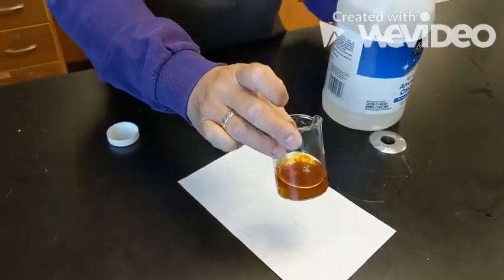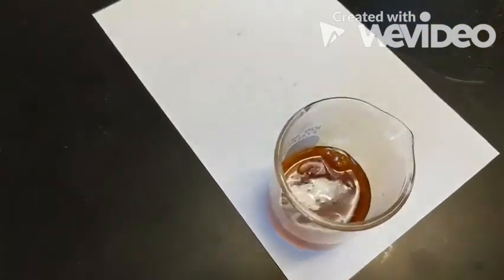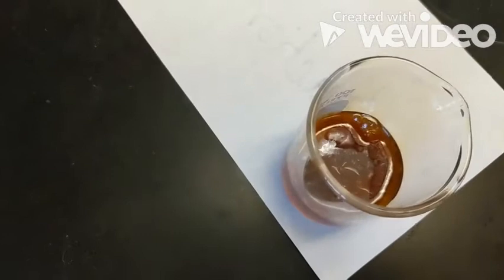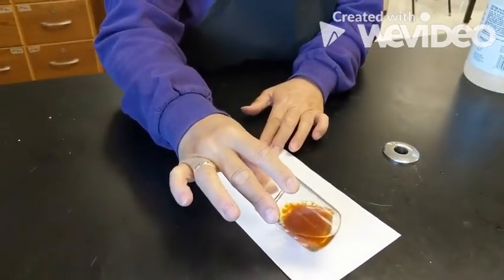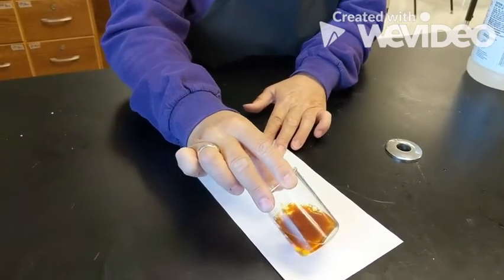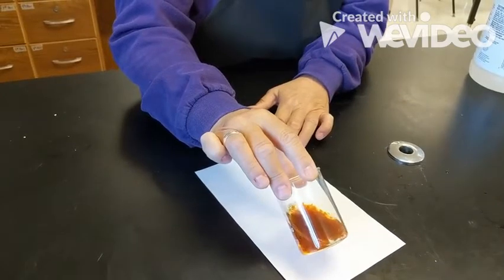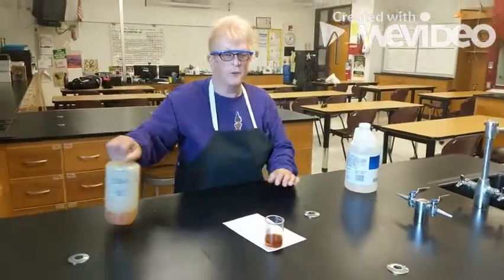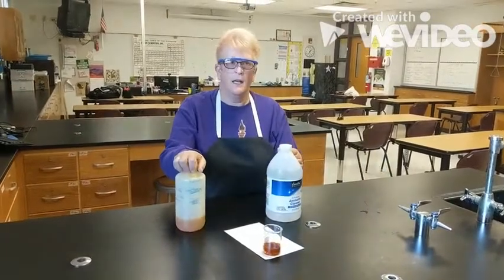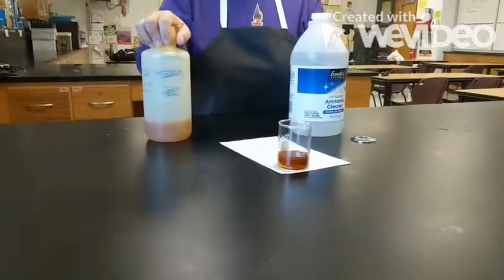So if we look at it, it looks quite a bit different than it did before, and I'm going to try to move it around so you can see perhaps a little bit more of what the consistency is of it now. So that again was station 5. We had iron 3 chloride and ammonia, and your after and the before are quite a bit different from one another.